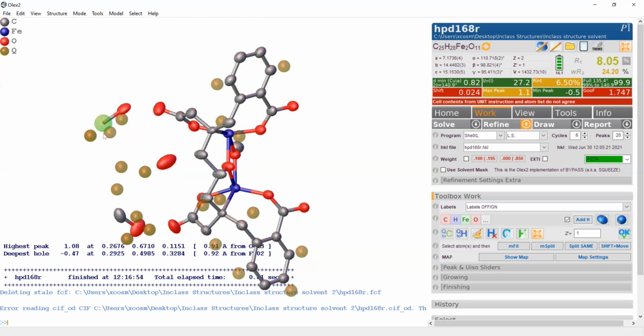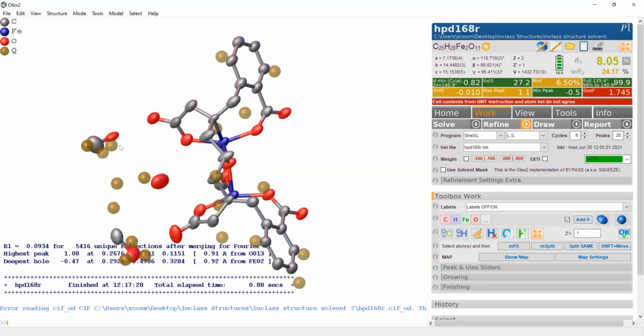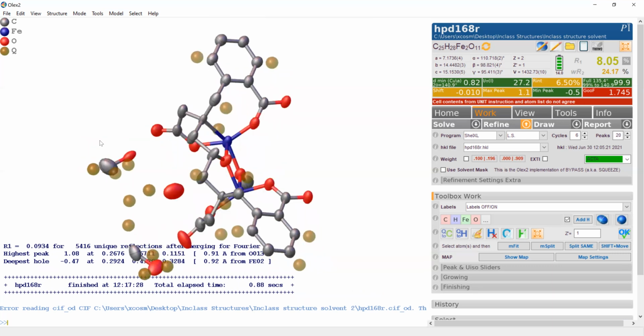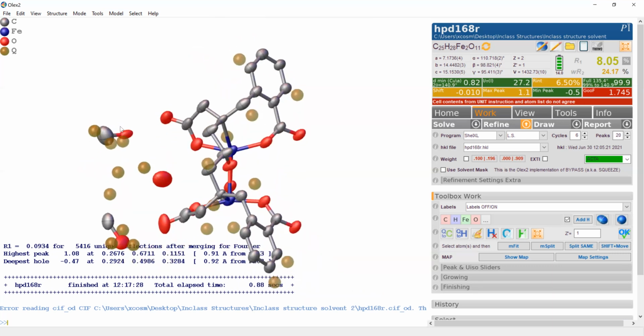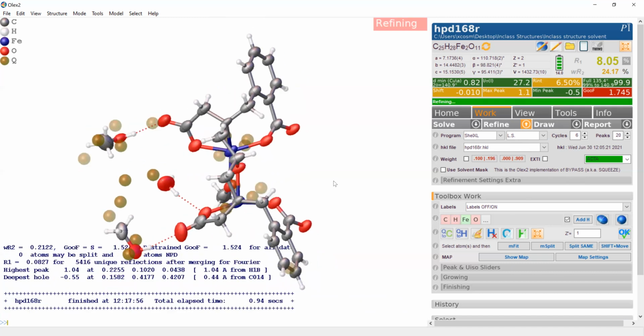So now this one carbon atom that's not anisotropic, if you select the carbon atom and go to model anisotropic selected, it'll only model that particular atom. So now we hit refine. And now we have the anisotropic. So next step, we're going to add hydrogen atoms. So we can just click add H. And it automatically refines it.